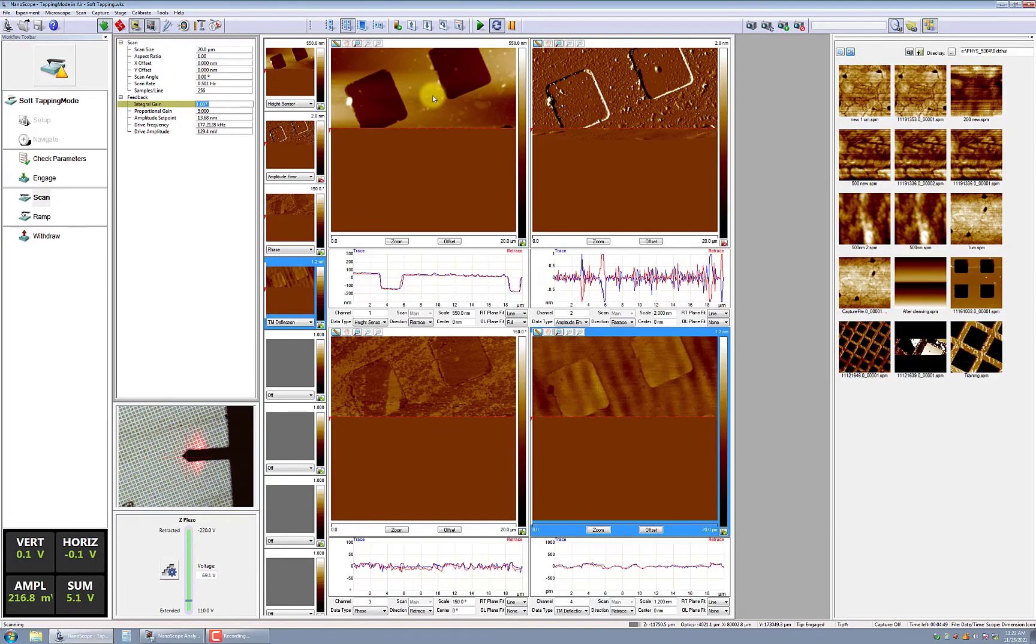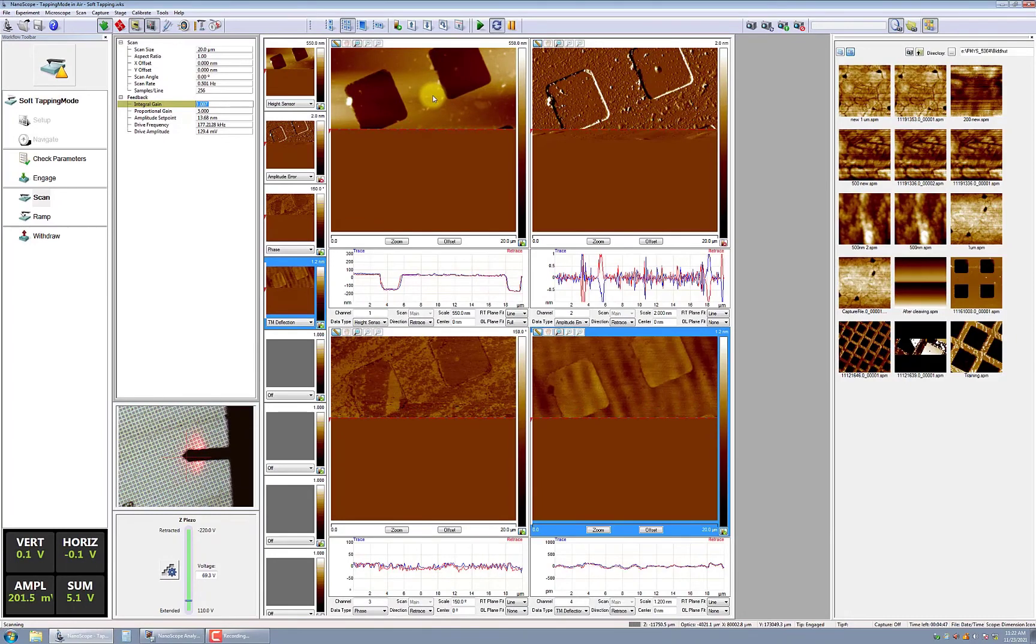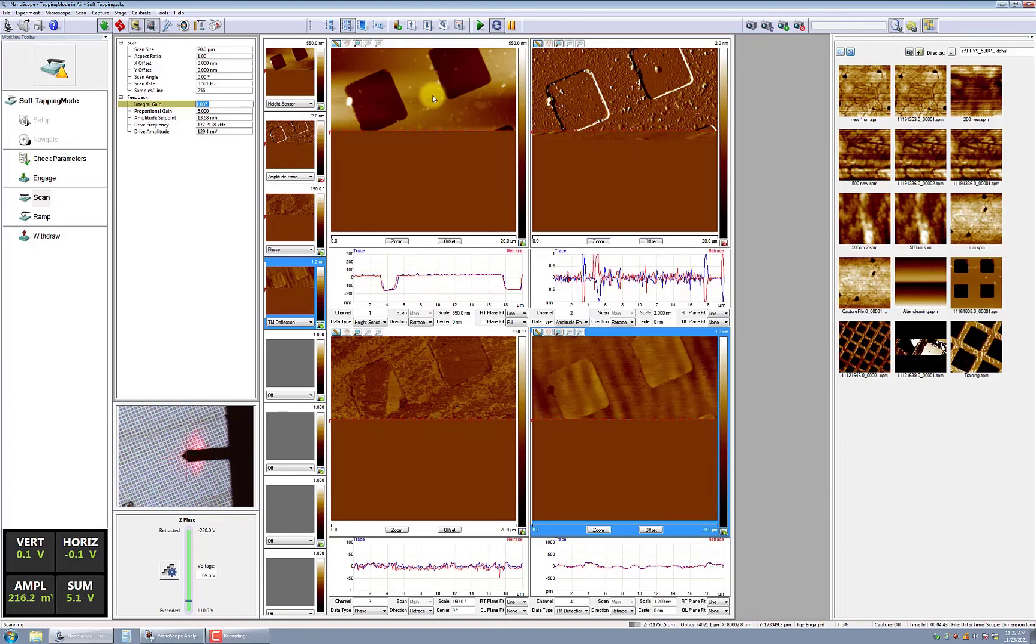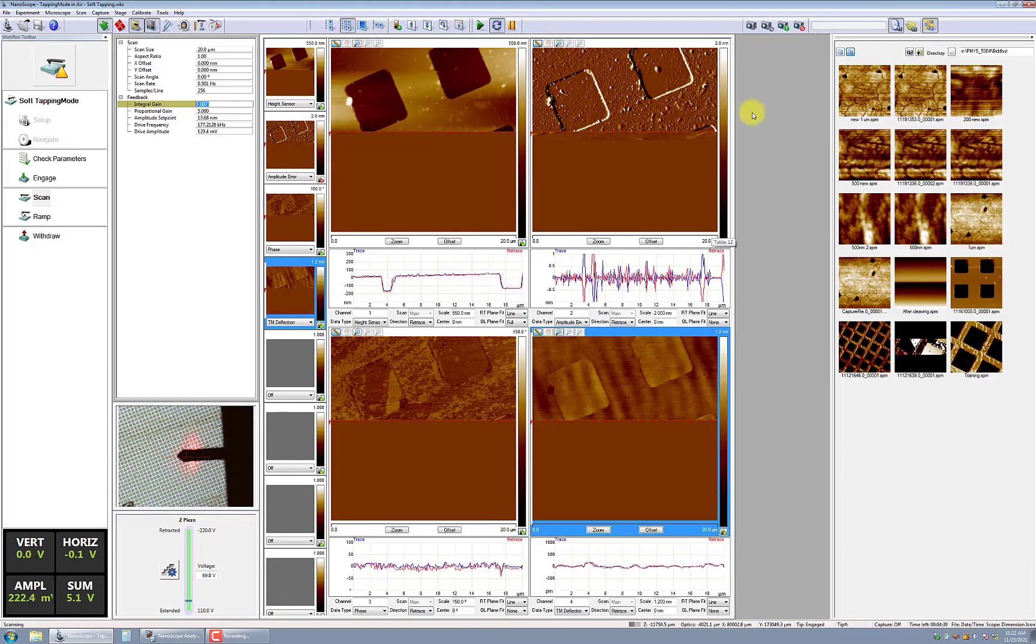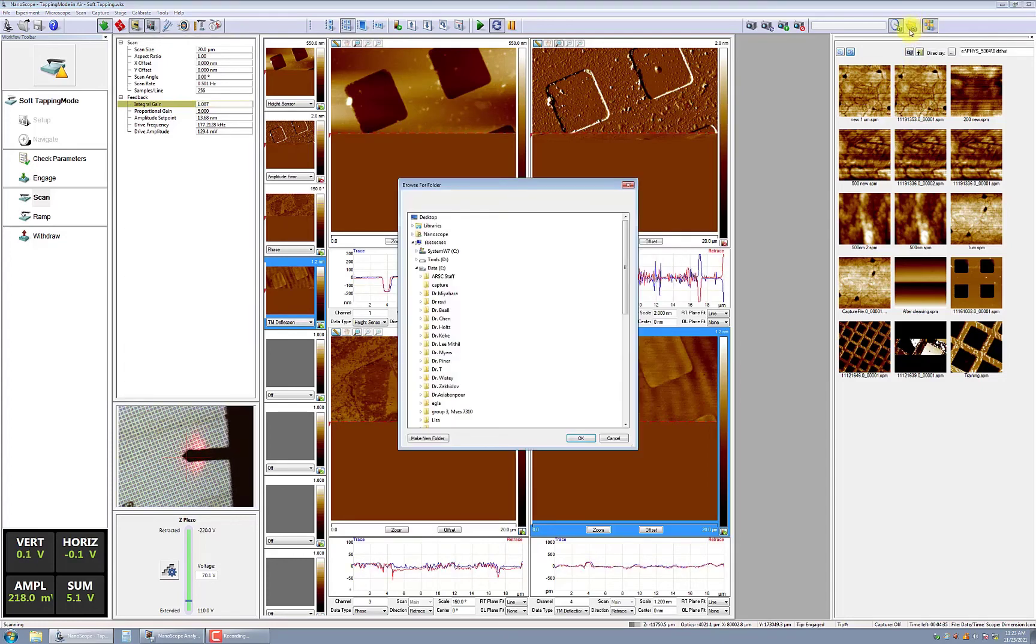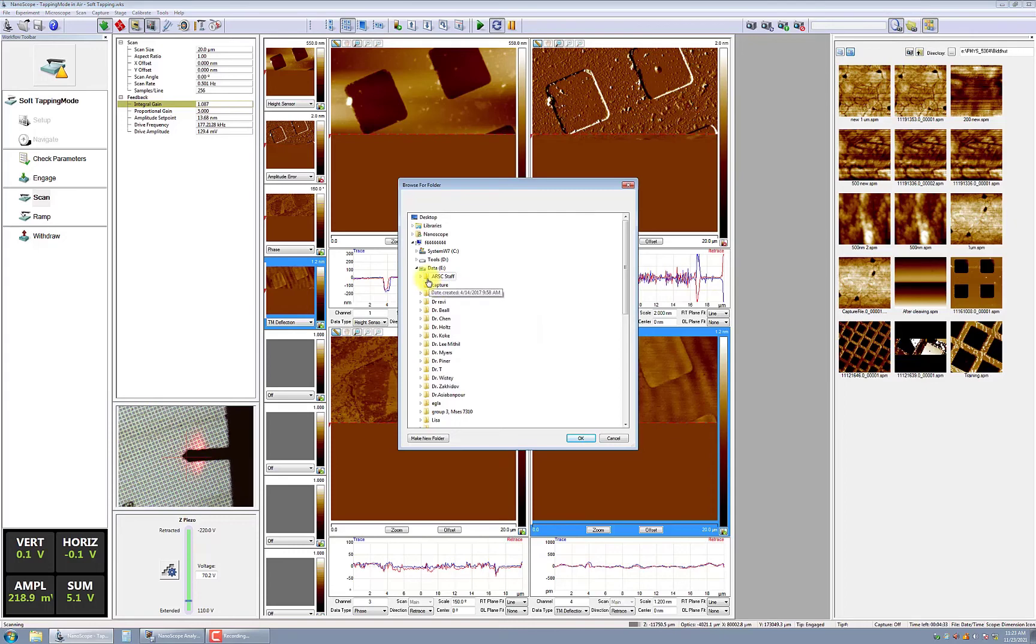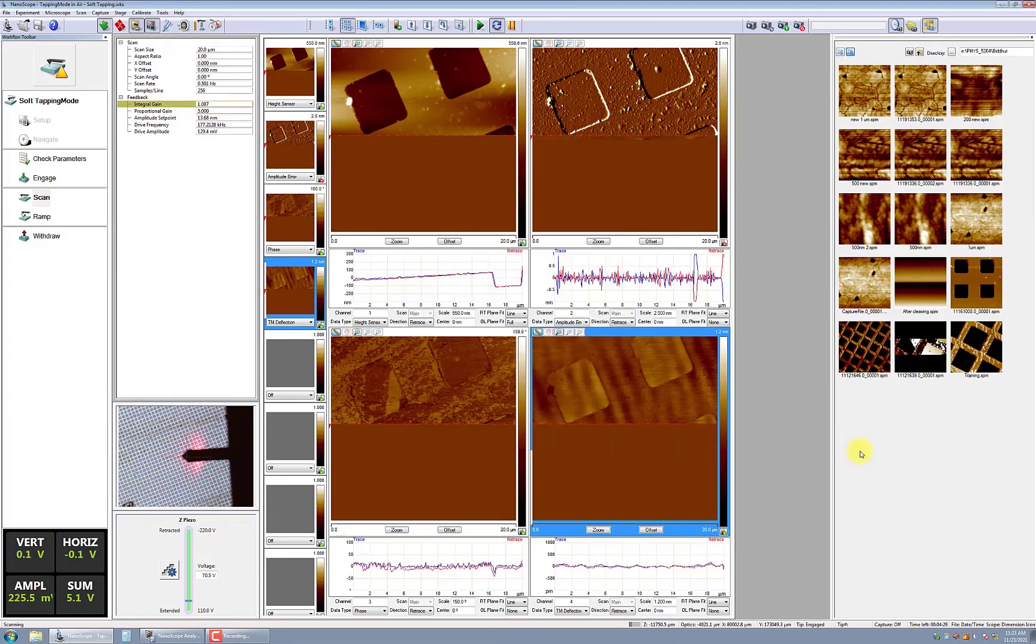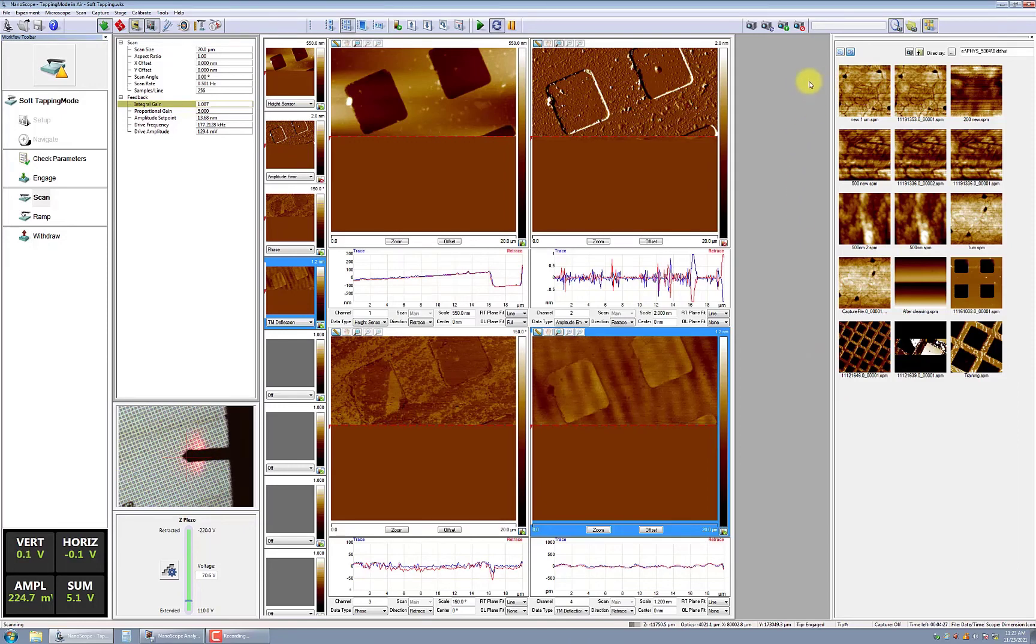Once all the scanning parameters are optimized, it's time to capture and save the scans. First, you'll want to set the capture directory and confirm that's the location where you wish to store your data. You should also give some thought to your file nomenclature, such as a timestamp data or specific identifying information in the file name.